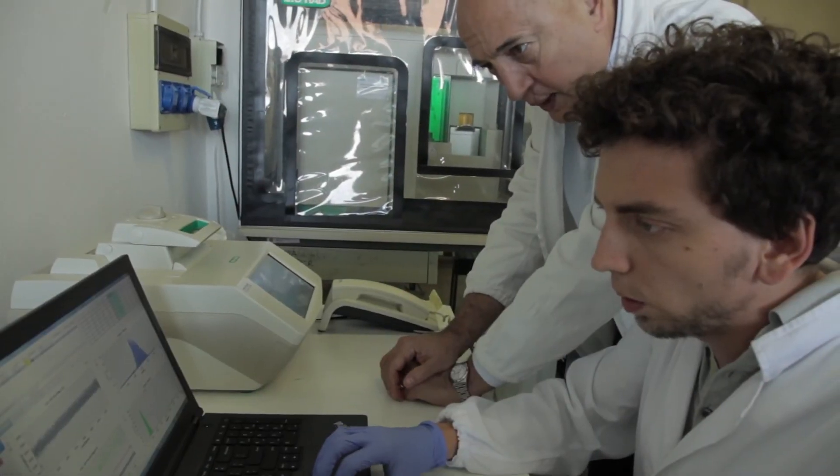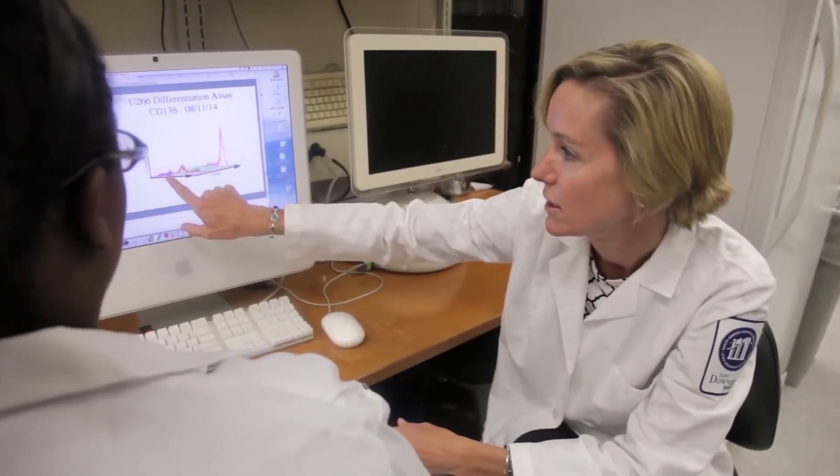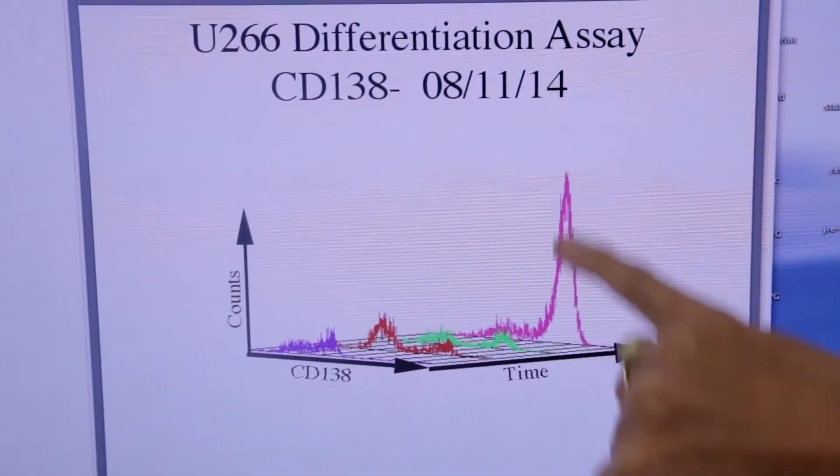Taking the necessary steps to get data you can trust is integral to research breakthroughs, so we made sure you can get pure, viable cells for your downstream genomics experiments using the S3E cell sorter.